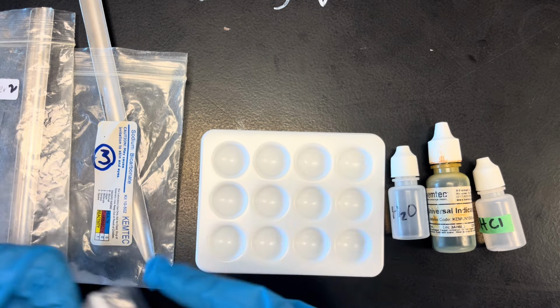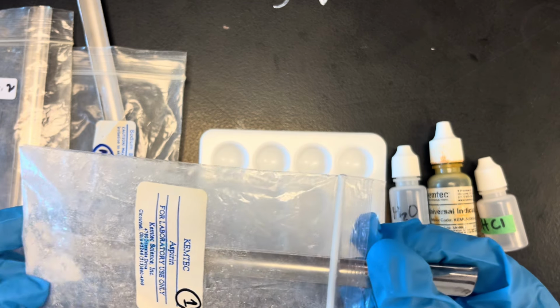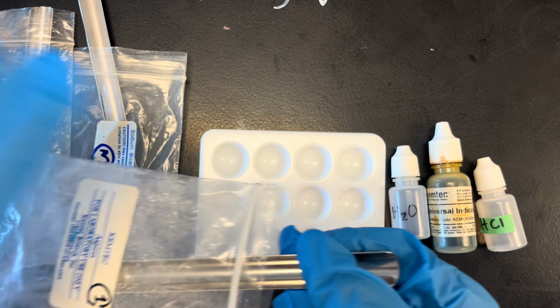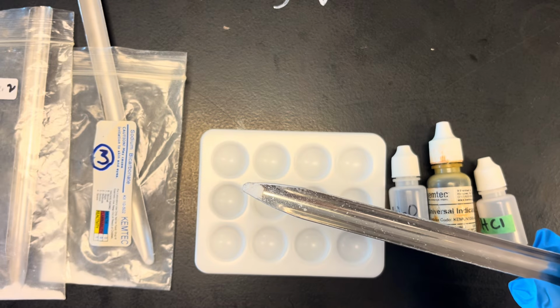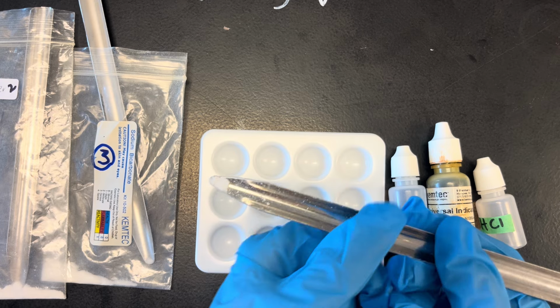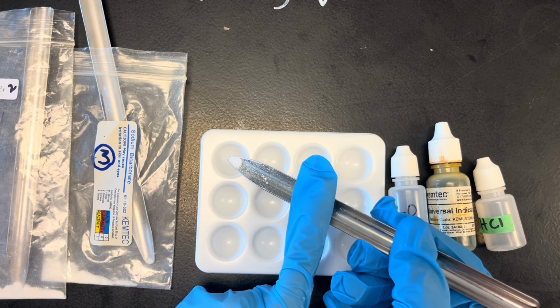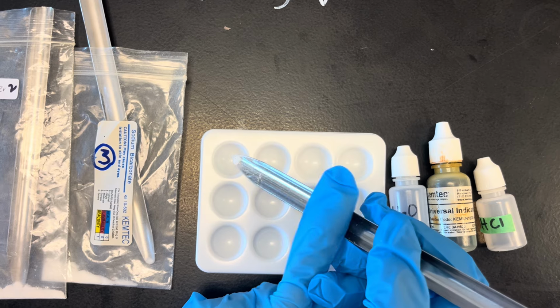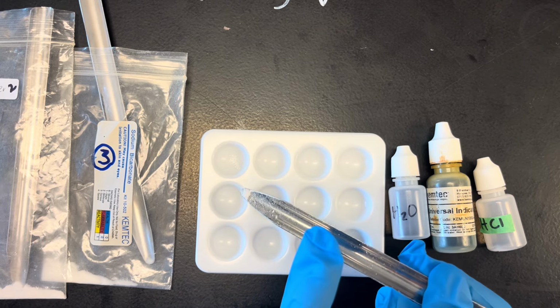I wanted to show you what a few granules look like. So for each of these tests, you're only going to need 2 wells. You're going to put just enough powder to cover the tip of the scopula, and then you're going to put a small amount of powder, it doesn't even have to be that whole amount, into each well. You only need 2 wells for each test. You'll see why.